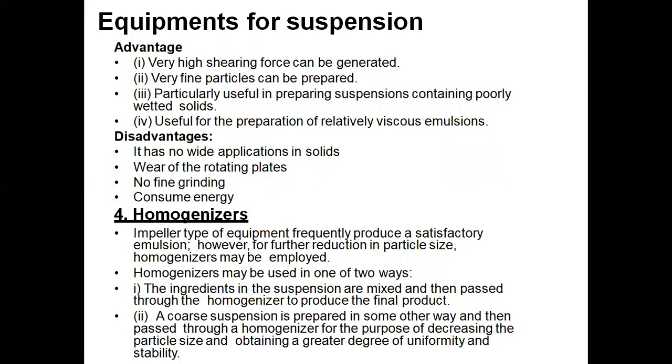Very high shearing force can be generated. Very fine particles can be prepared. It is particularly useful in preparing suspensions containing poorly wetted solids, and useful for preparation of relatively viscous emulsions. Some disadvantages are also available. It has no wide application for solids, there is wear of the rotating plates, no fine grinding, and it consumes energy.